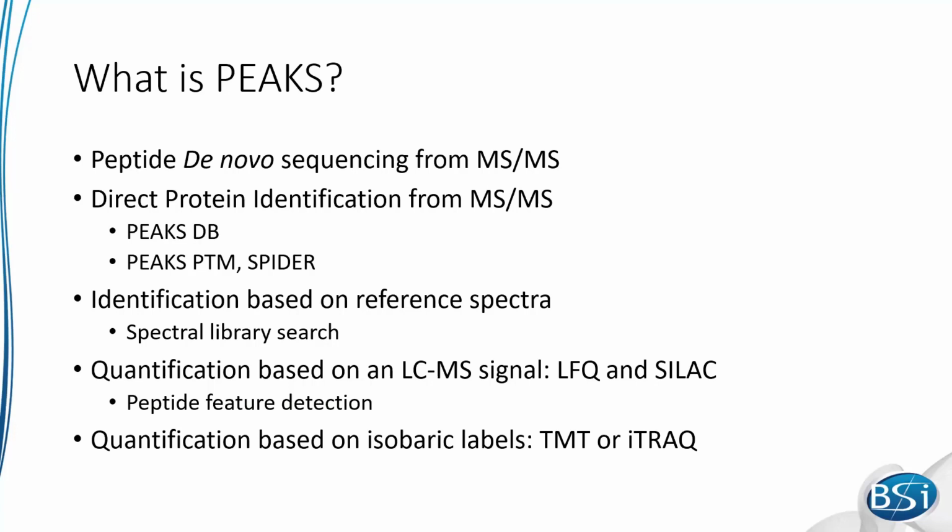Also we have our quantification tools, so label-free quantification or SILAC quantification, which are based primarily on peptide feature detection, and I'll go through that a little bit, as well as quantification of isobaric labels such as TMT or iTRAQ.